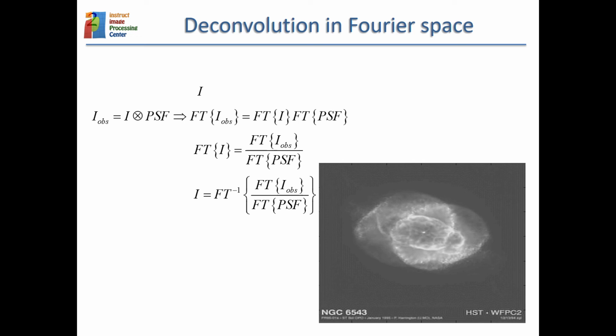There is another complication in electron microscopy, that is that the CTF, that is the Fourier transform of the PSF, crosses zero at given frequencies. So that means that the information at those frequencies has been completely lost, and this complete loss of information means that you cannot divide, you have multiplied by zero, so you cannot divide by zero to recover the original information.